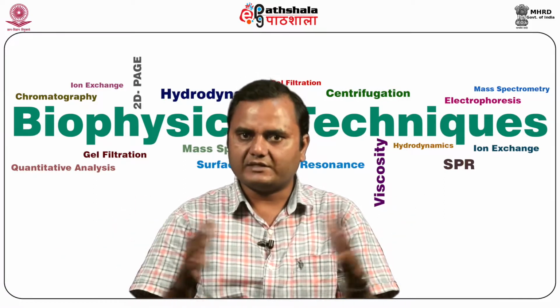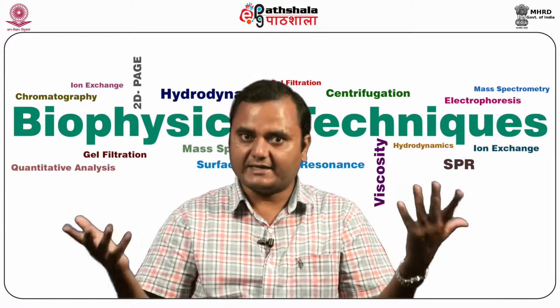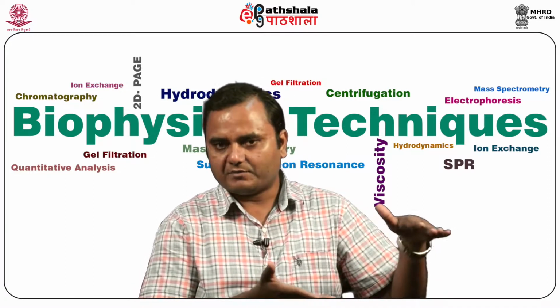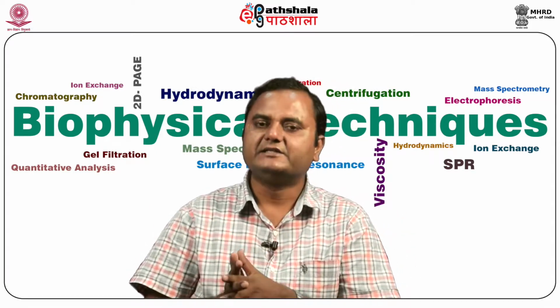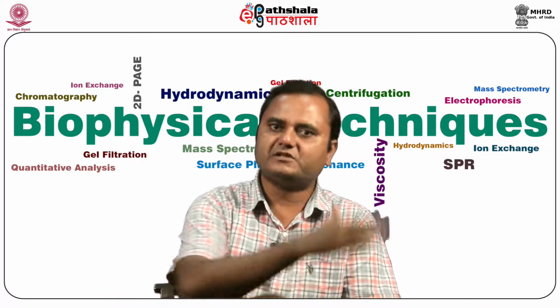For example, a protein is forming oligomers or aggregates in a certain condition, then what are the factors, and what are the kinetics of aggregate formation. At the same time, if you want to dissociate an aggregate, you can also see what the kinetics of dissociation of that aggregate are.